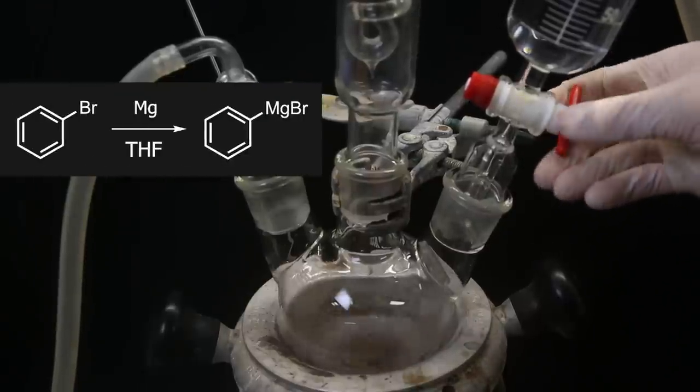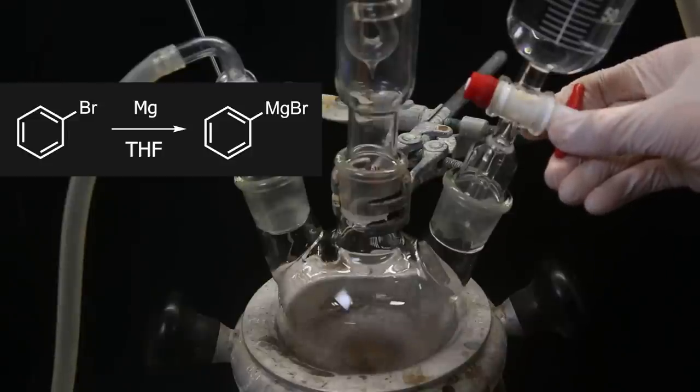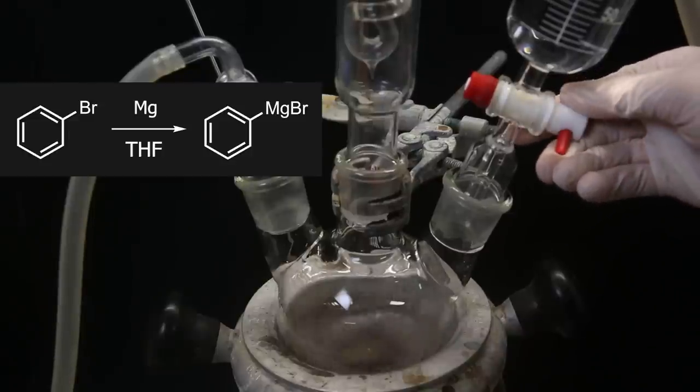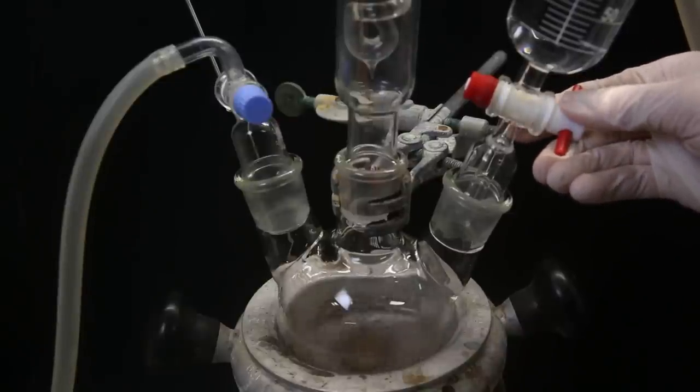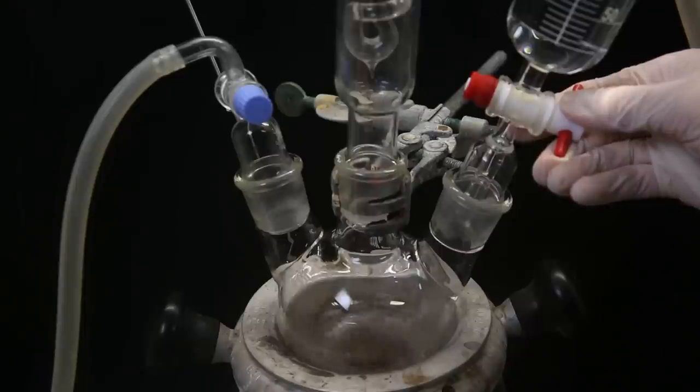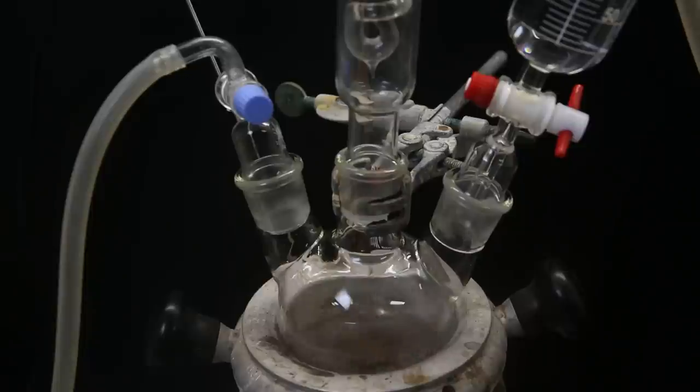In the reaction, the bromobenzene will react with the exposed magnesium, to form the Grignard reagent phenylmagnesium bromide. The reaction generates some heat, but it doesn't really boil that much compared to when you would use diethyl ether.